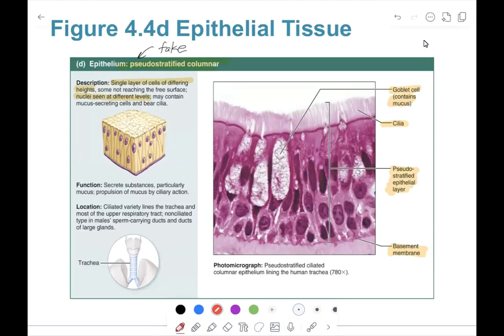And some are kind of fat at the top. That's not the best color, so let me switch to blue. Maybe that'll be a little easier. But essentially, it's really difficult to tell what would be one cell. The outline there is kind of difficult to see, but the blue outlines one single cell.